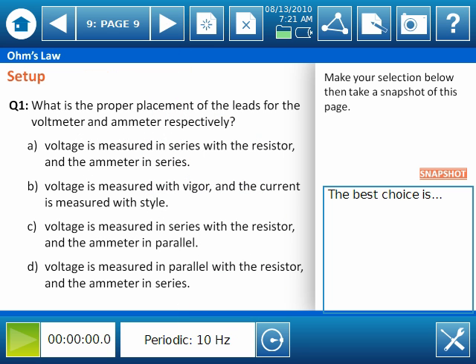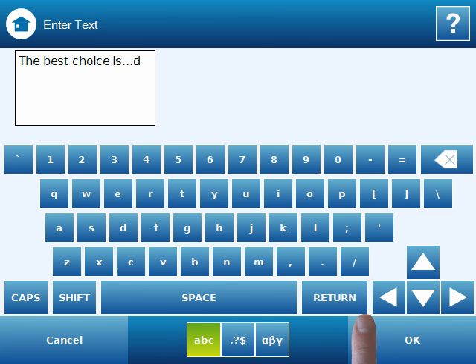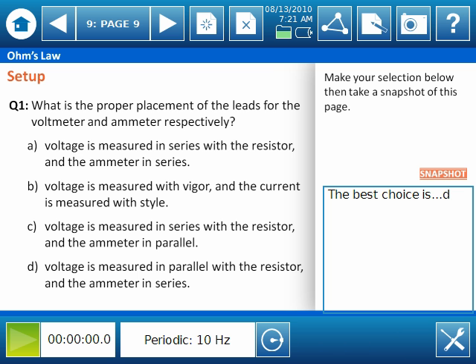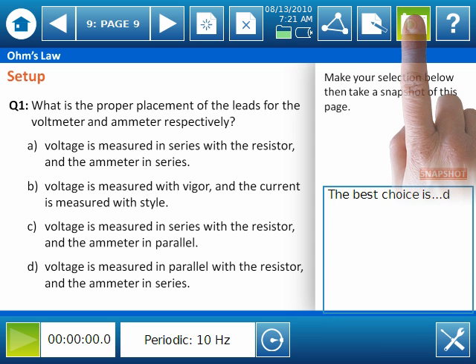To check student understanding and ensure they are vested in each part of the Spark Lab, quick self-check questions are spread throughout the labs. To answer the questions, select the blue text entry box and enter your answer. Again we see the snapshot icon on the page, so we'll select the snapshot button to enter this page into our journal.